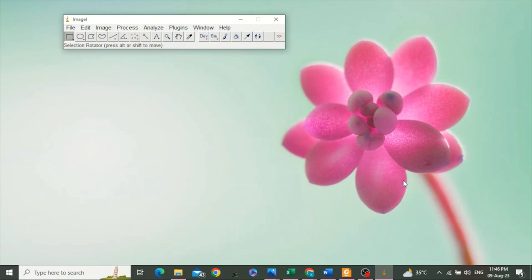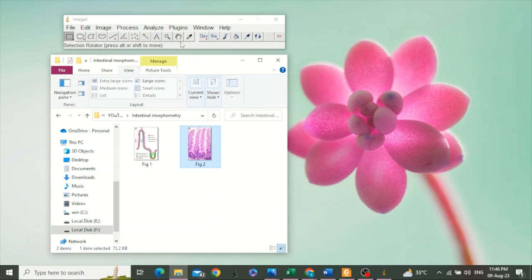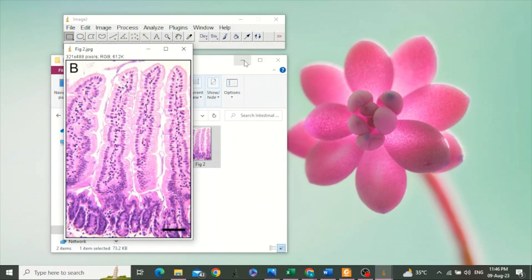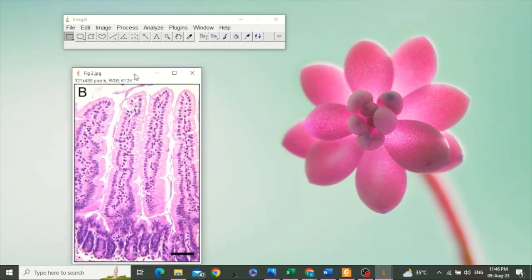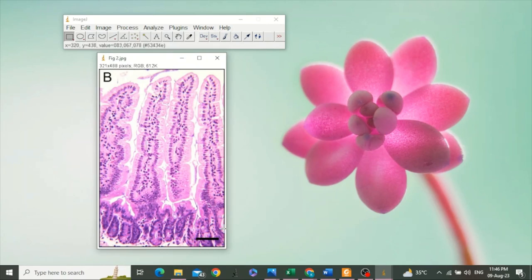Take this image, drag and drop it. Here you can see in this image there is a scale bar. The length of the scale bar is 100 micrometers. You can calibrate your ImageJ software by using this scale bar.